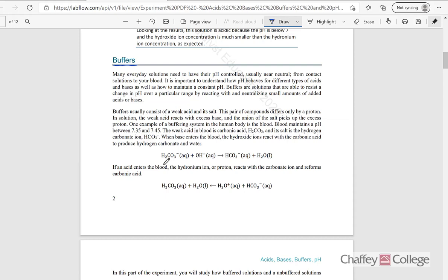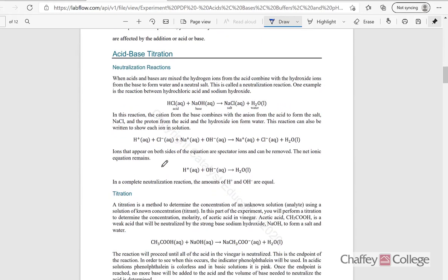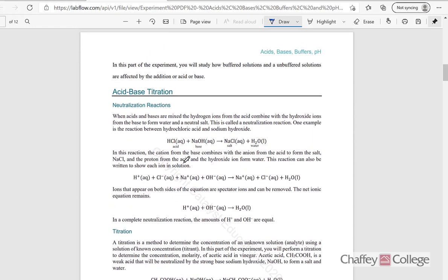In today's experiment we will take a buffer, add acid to it, measure its pH, and see what happens — does it really remain constant or does it change? And finally, the third part of today's experiment is acid-base titration, in which we conduct a neutralization reaction between an acid and a base. We have an unknown concentration of an acid, and we can determine that concentration by reacting with a base whose concentration is already known.